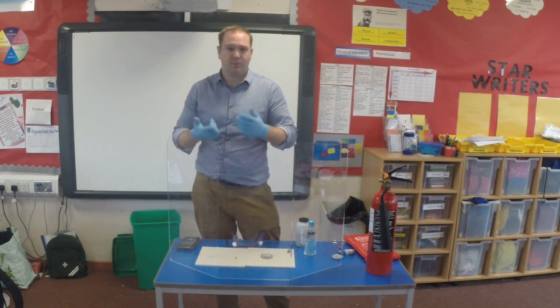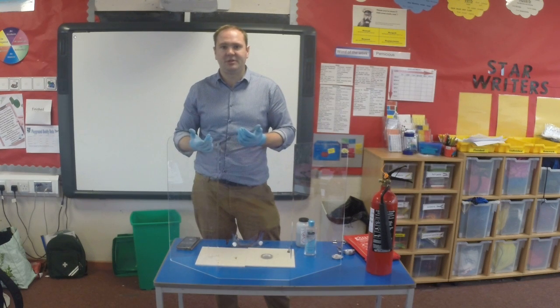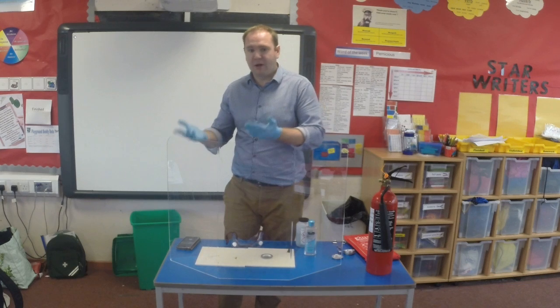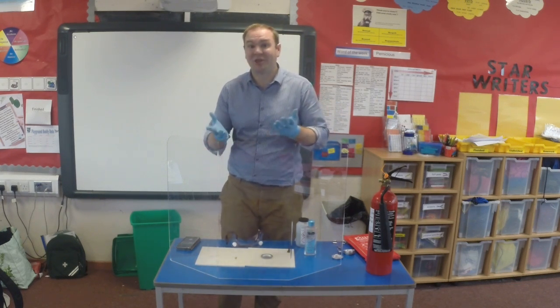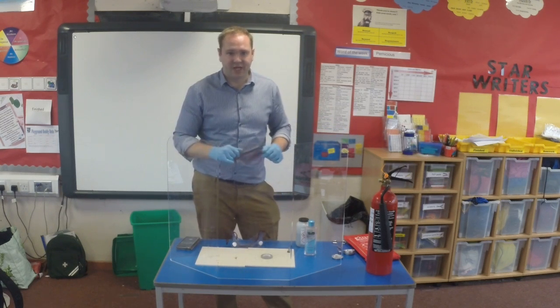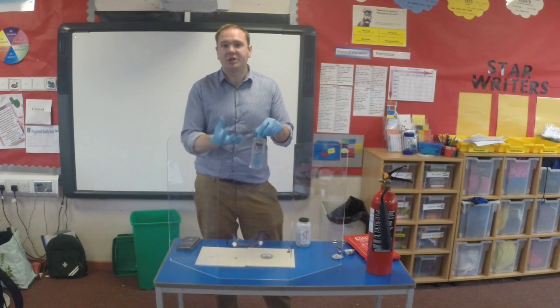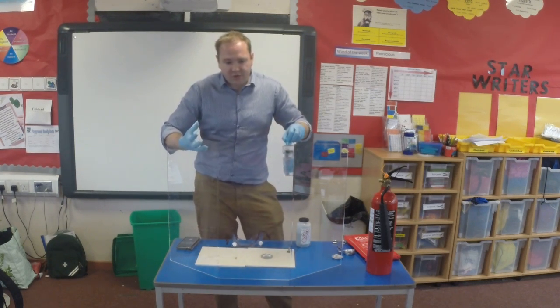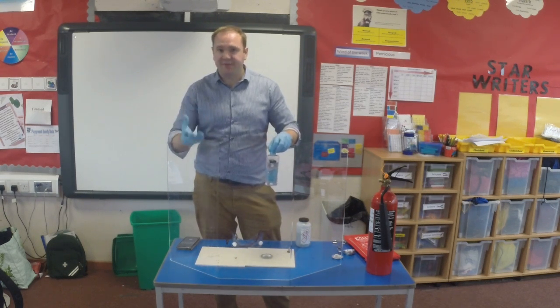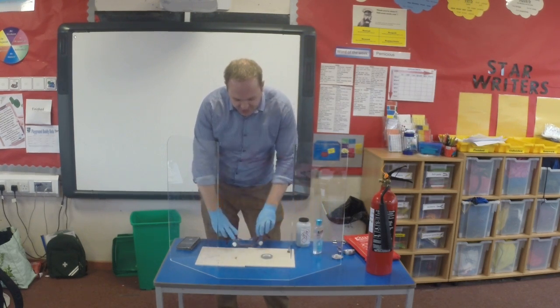useful work. Chemical energy is what fuels the vast majority of our energy production and our energy needs across the world through power plants. Whether or not that's a good thing or a bad thing, definitely a bad thing, that's a discussion for another time. But what we have here are some chemicals that have chemical energy locked up inside them. We can release some of that energy and transform it into different kinds of energy, such as heat and light. And that's what this experiment is going to do.